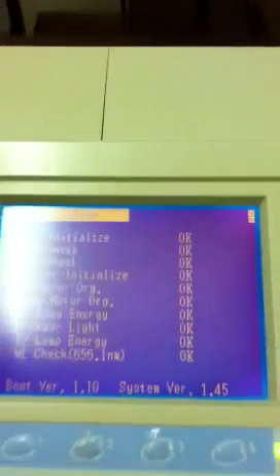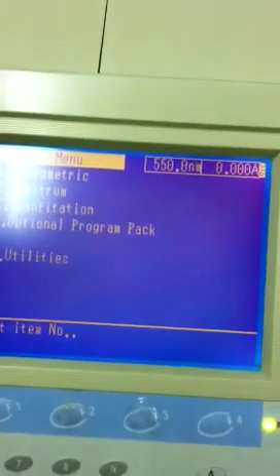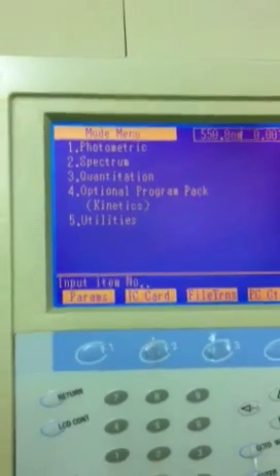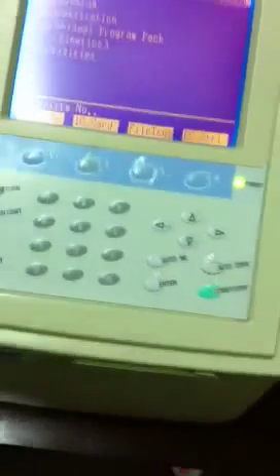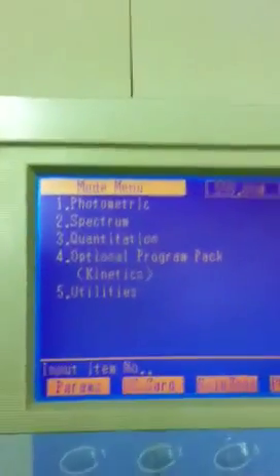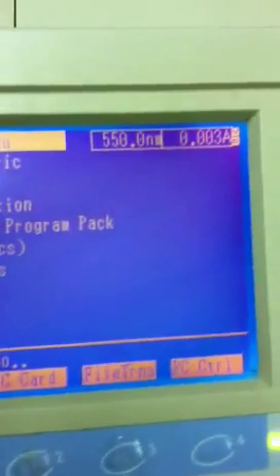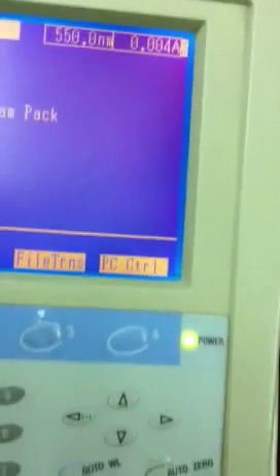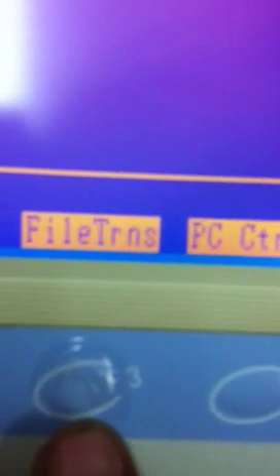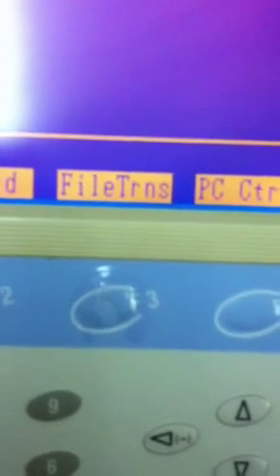Right now the instrument is turned on and it has just completed its initialization cycle. You can look at the physical condition of this unit. This is the main screen, this is the keypad. Just to let you know that these buttons, it's just the polythene which is covering the buttons, they are working fine.